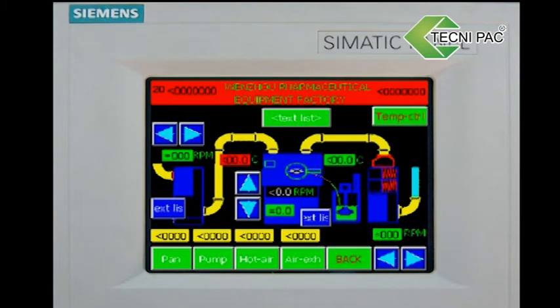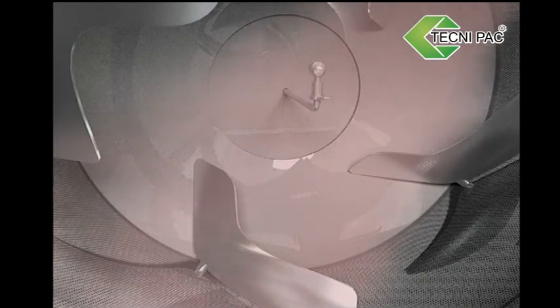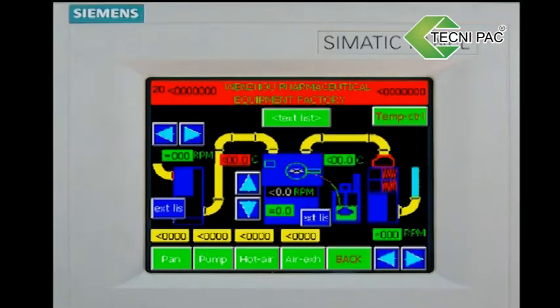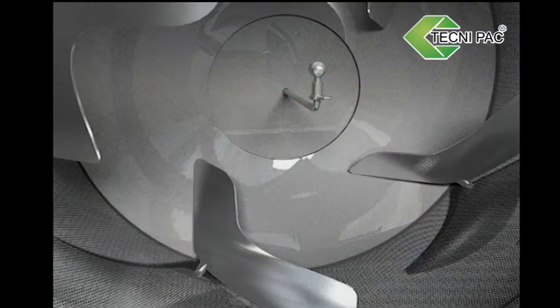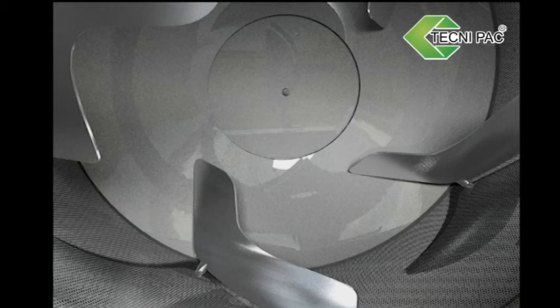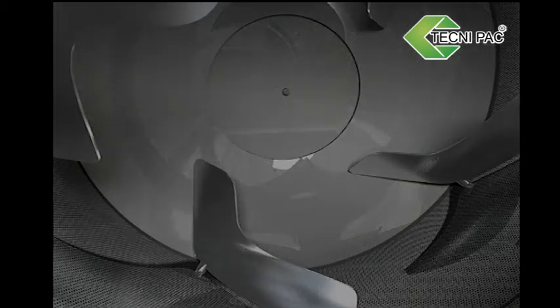Close all the water supply valves and convey compressed air to the pipeline to dry the clean bore and delivery pipe by starting the solenoid valve. Meanwhile, dry coating boiler and rinse tank pipeline by starting hot air as per the set time. Upon completion of set cleaning procedures, the system will automatically stop running. Remove the cleaning shower nozzle inside the coating roller and tighten the sealing cover.